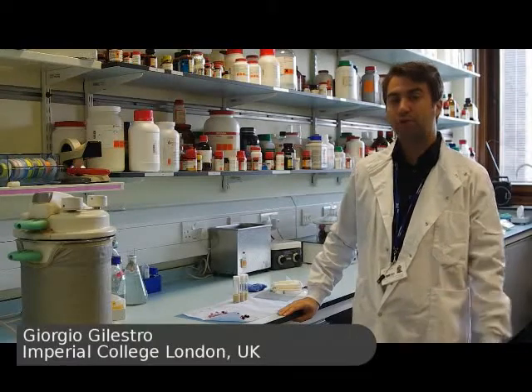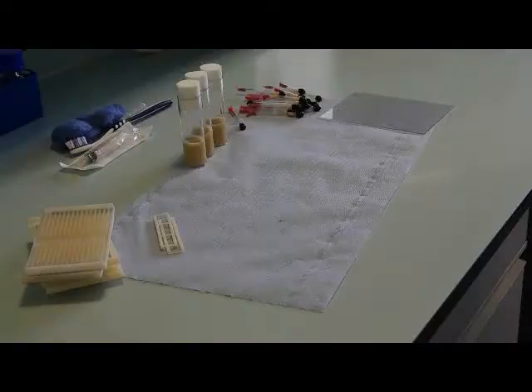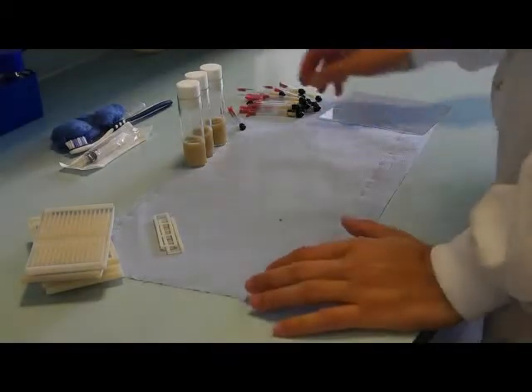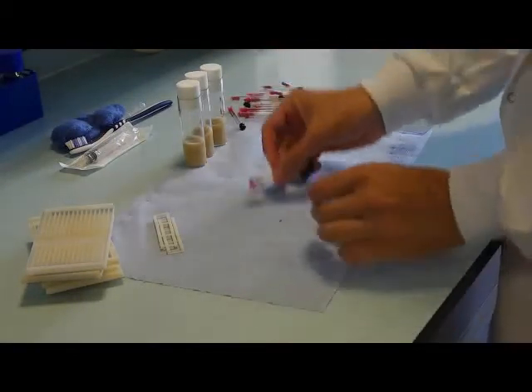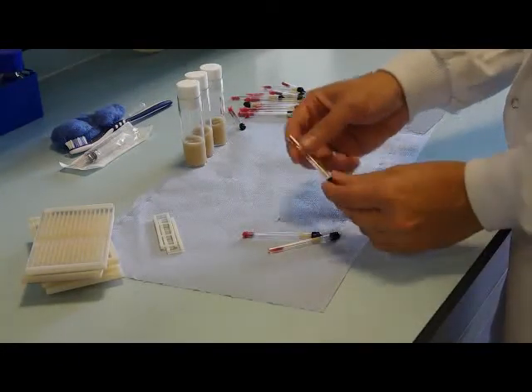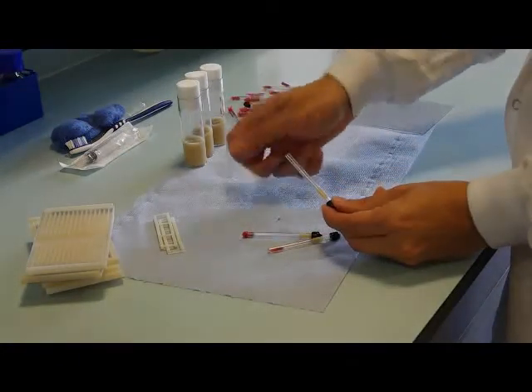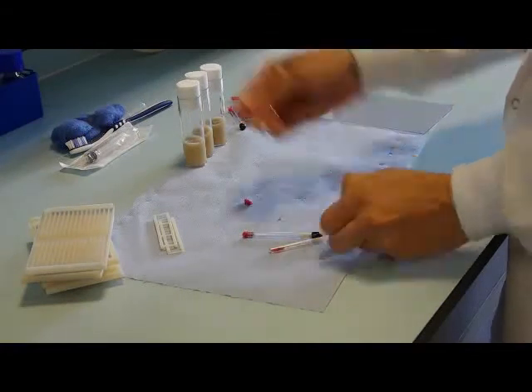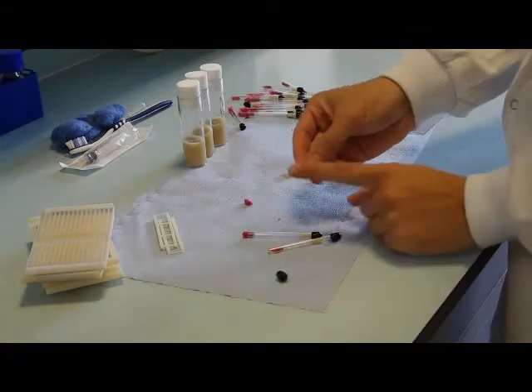Hi! In this video I'm going to show you how to prepare an arena for video tracking. Detection of movement based on the traditional split beam system is carried out using little glass tubes, like these ones. Single flies are hosted into each tube, trapped with cotton wool on one side, and a plastic cup or wax on the other. Food is also provided.